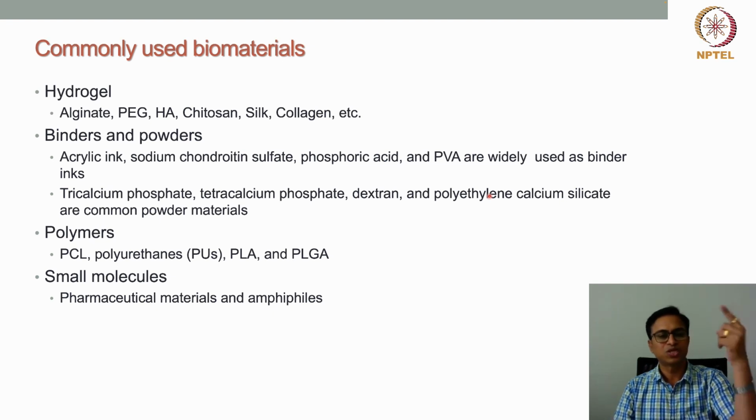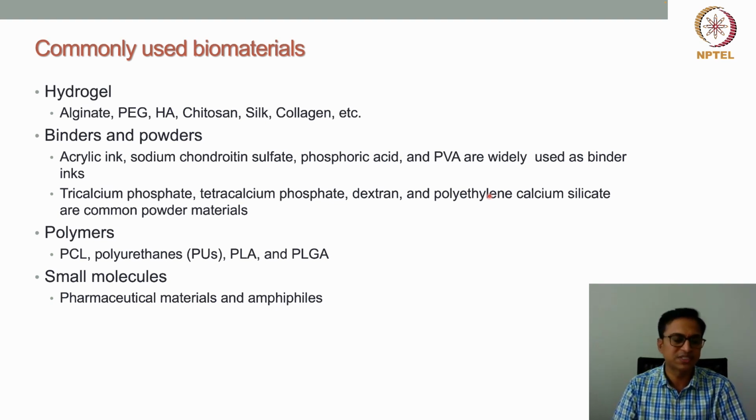Then the same phenomenon applies, where these polymer solutions are loaded into the cartridge. From the cartridge, it reaches the nozzles, and from the nozzles, based upon whether it is thermal or piezo, the droplets are generated and then plotted. Now, when we use an organic polymer solution with a volatile solvent, the solidification process is much easier, because after printing the solvent can be easily evaporated, and then we get either solid particles or a solid structure.